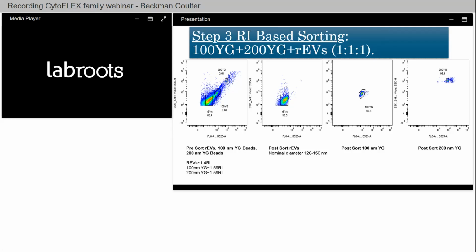And you can see here, not much issue, even though our picture all the way to the left that has all the populations is not necessarily the most beautiful. But we were able to put these gates here, use our fluorescence to separate and pull out multiple populations.